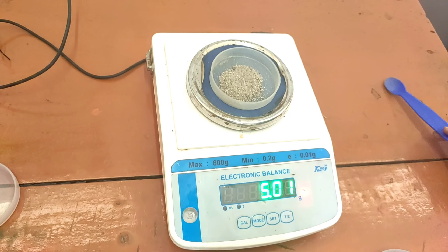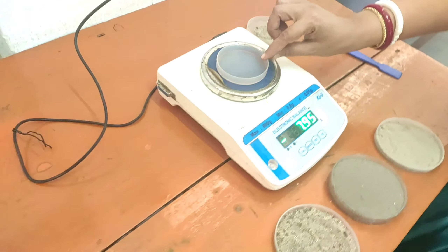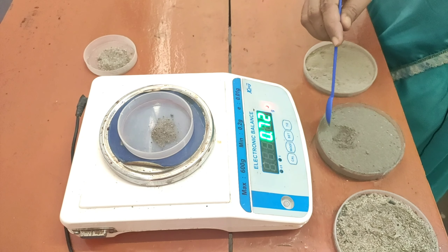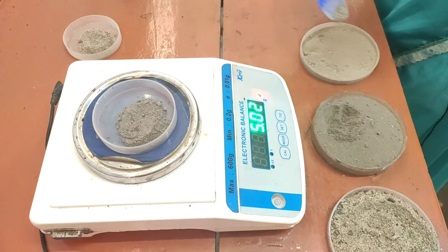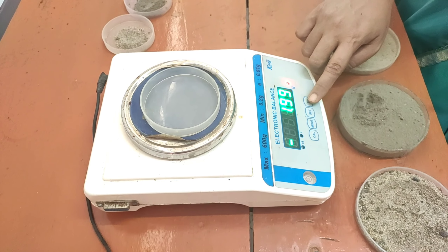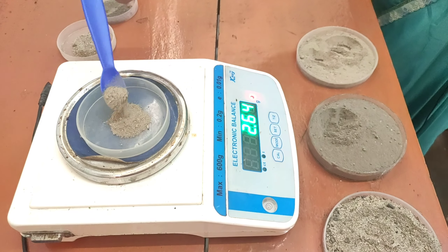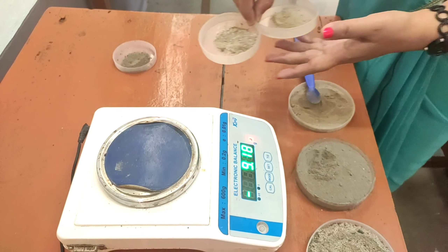It has almost reached five grams for sample A. Now let us take another petri dish for the next sample. We set it to zero again and collect five grams of sample B — that is also five grams. Now for the third sample, again we adjust and collect five grams. This is also five grams. Now we will do the next step after measuring.